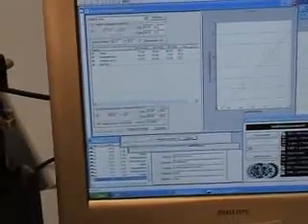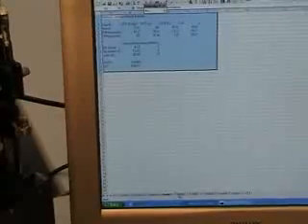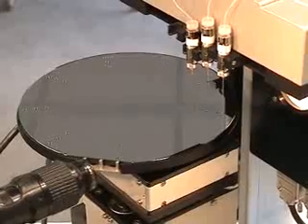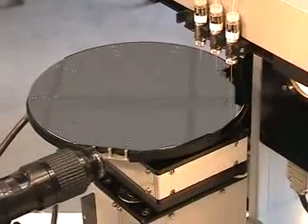We can click through all the Excel data where we see all the results which we have collected. The last position will be measured now.